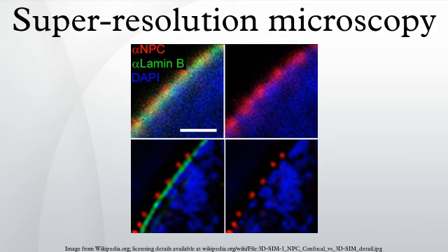As the molecules return stochastically, they can be excited to fluoresce so that single molecule positions can be recorded. Development of the D-STORM method occurred in 3 independent laboratories at about the same time and was called reversible photobleaching microscopy (RPM), ground state depletion microscopy followed by individual molecule return (GSDIM), as well as the now generally accepted moniker D-STORM.